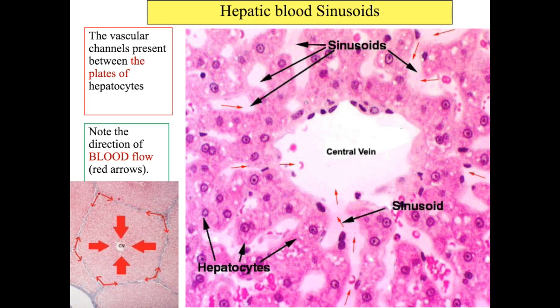Notice here the hepatocytes having a central rounded nucleus, clear with a prominent nucleolus, and they are hexagonal or pentagonal in shape, and they appear vacuolated. Why do we have vacuoles here? Due to the dissolving of the glycogen present in huge amounts in this liver cell.